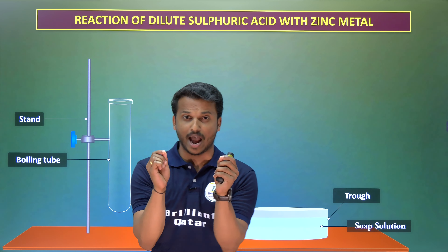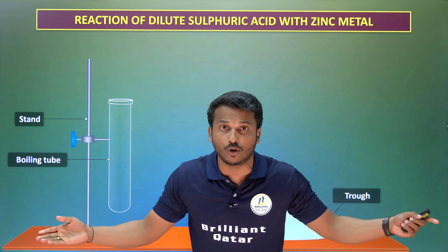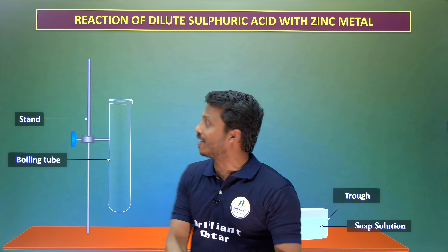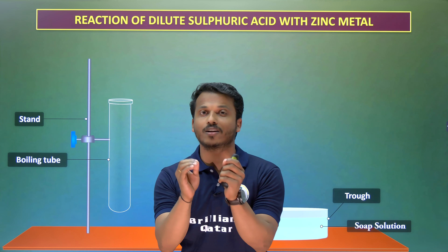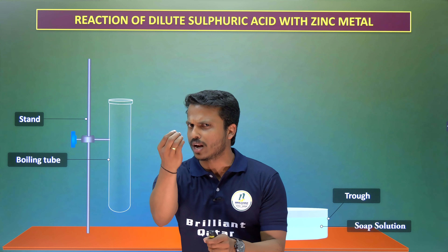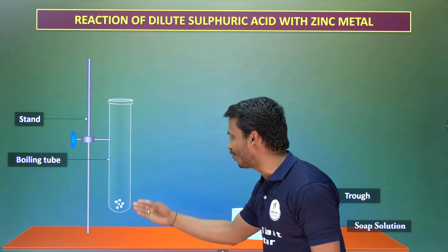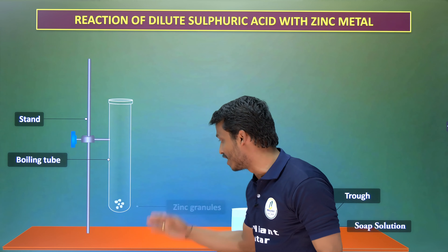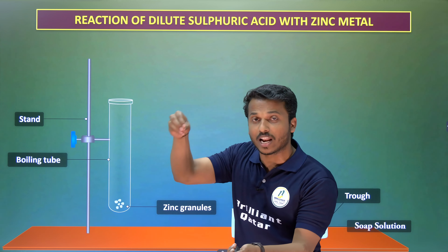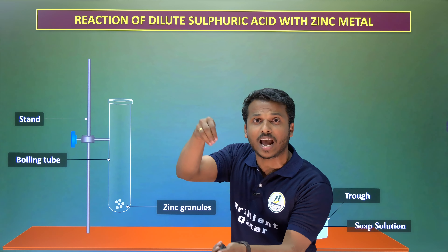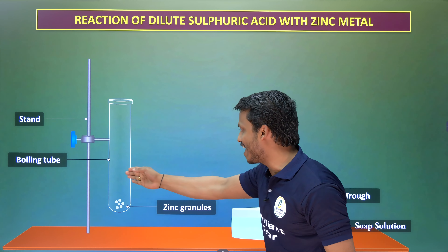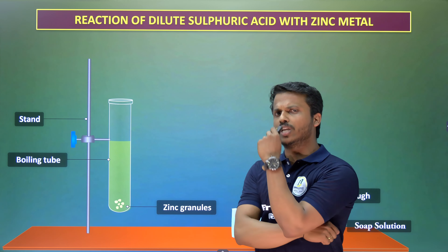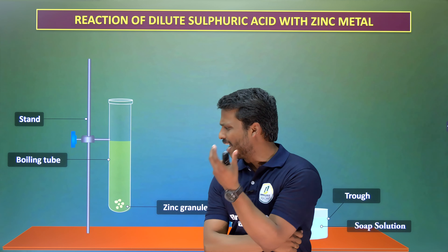It is a reaction between dilute sulfuric acid — H₂SO₄ — and zinc granules. Let me take some zinc granules first. Here we have the zinc granules. Now let me add some dilute sulfuric acid.